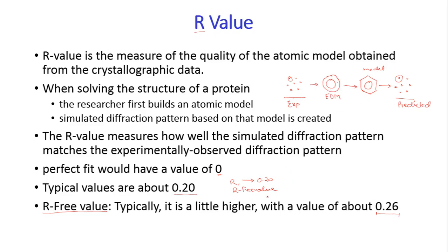So my take home message is that when you search PDB for a particular model, which I am going to demonstrate in a while, you are supposed to look for two terms in every structure. Check what the resolution is and check what the R value is.